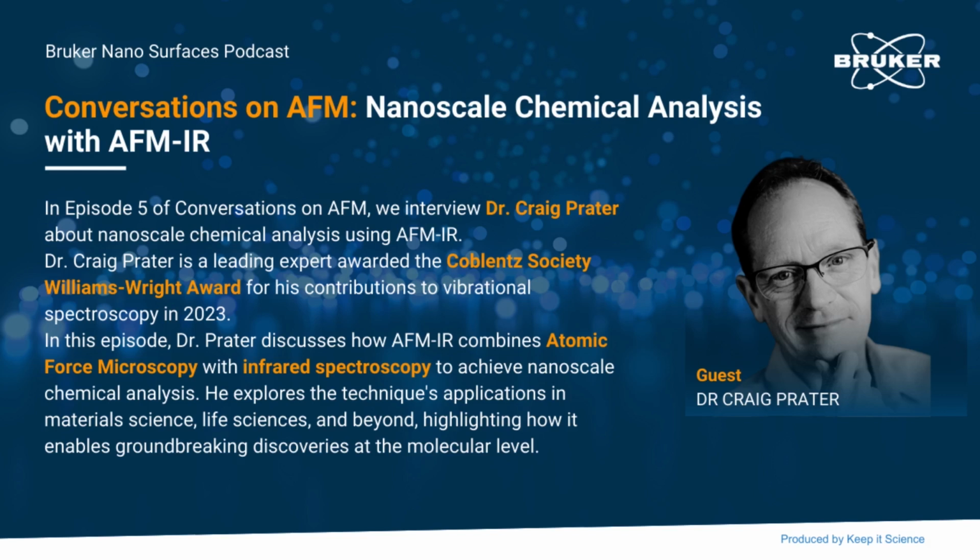Unfortunately, that particular implementation of using an FTIR was not well suited to getting the best results out of an AFM. The sensitivity was low, and the spatial resolution was not what the market was really looking for.